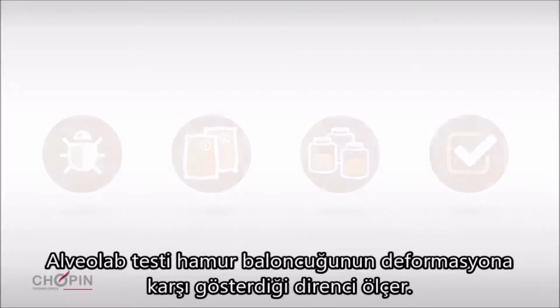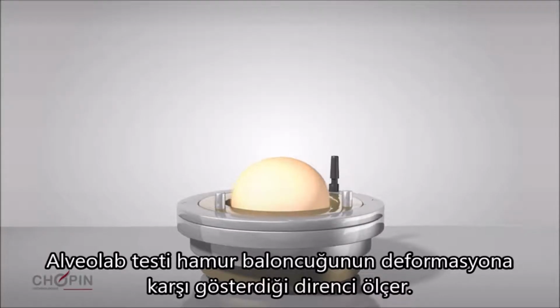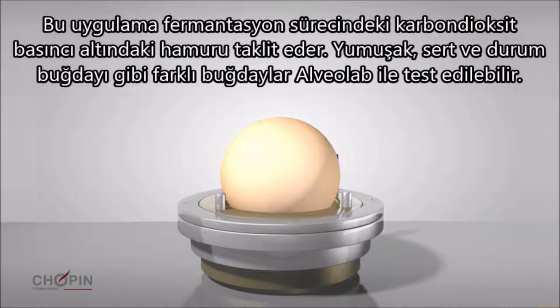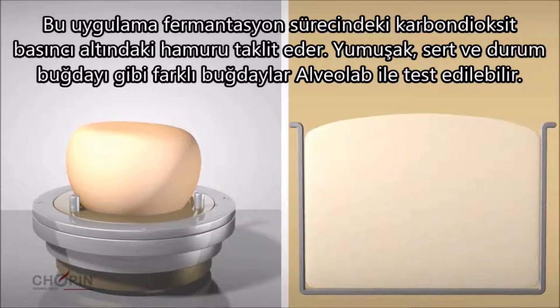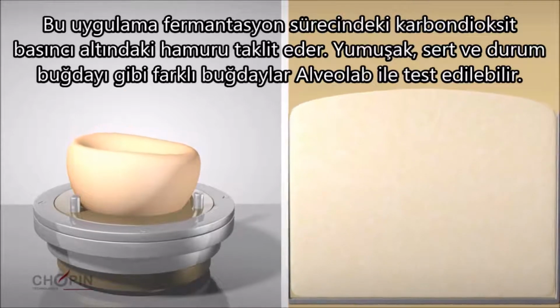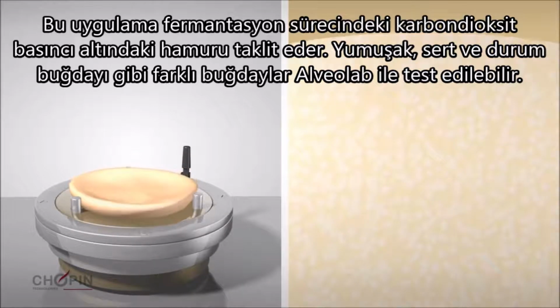An alveograph test involves measuring the deformation of a dough bubble caused by a specific pressure generated using air. This dough extension method simulates the deformation the dough undergoes during fermentation due to the pressure generated by carbon dioxide. The alveograph can be used to analyze all types of wheat: soft, hard, and durum.